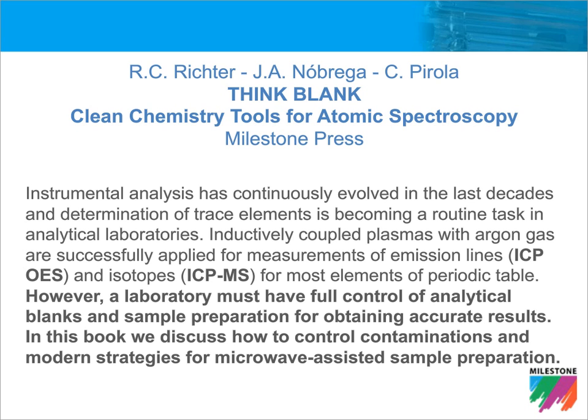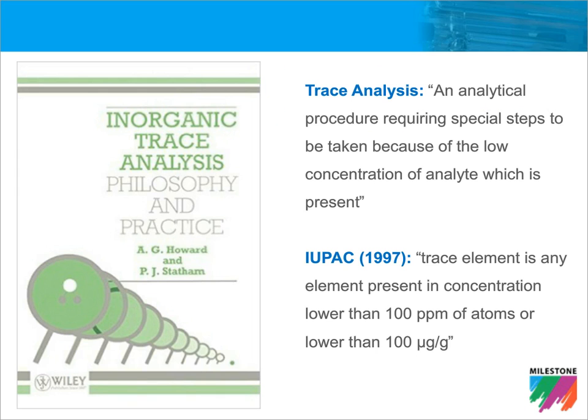According to IUPAC, a trace element is any element present in concentration lower than 100 ppm. A broader definition is that trace analysis is any analytical procedure requiring special steps to be taken because of the low concentration of analyte which is present.